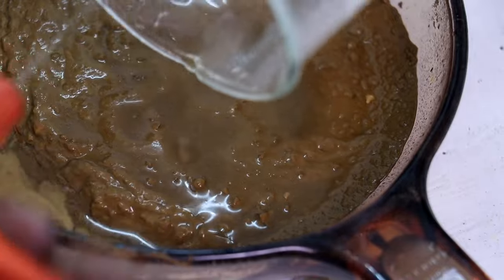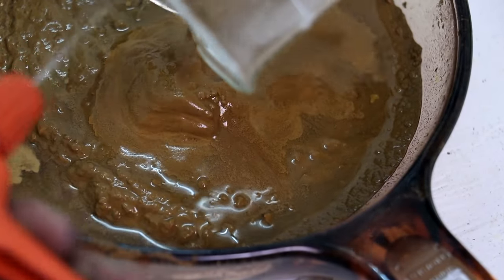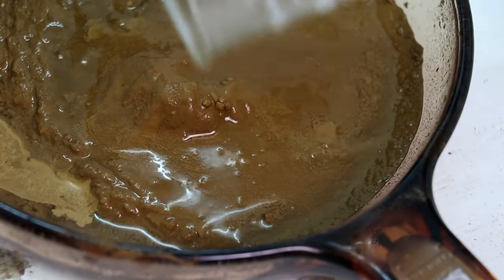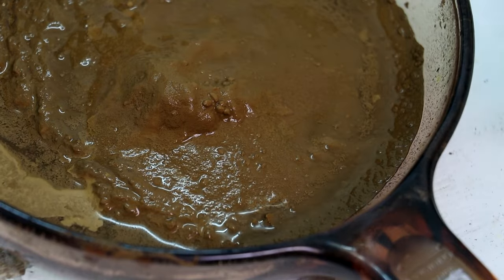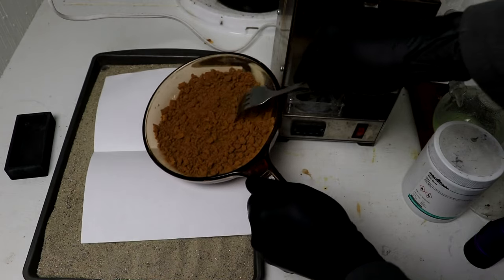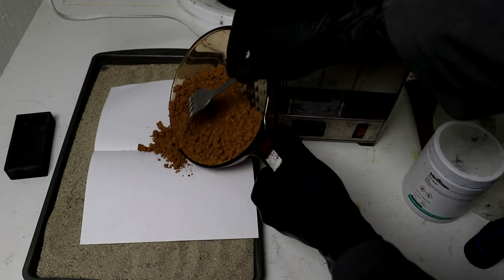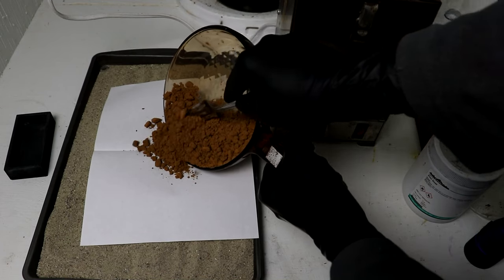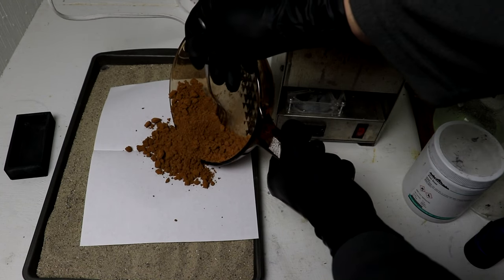Now that the gold has been successfully converted back into metallic form, I've washed it with some pure water, and right now I'm putting it onto a little pan so that I can dry it out. So here's the gold powder after being dried. One interesting thing about this is it still feels heavy, even though I've removed the water weight. Which I guess makes sense because gold is very dense.